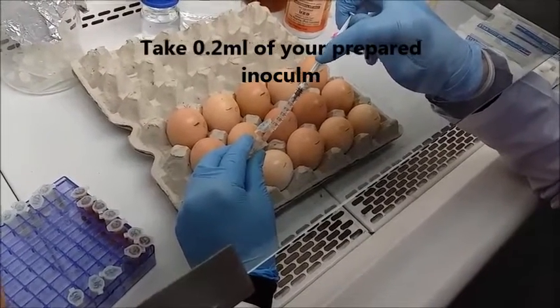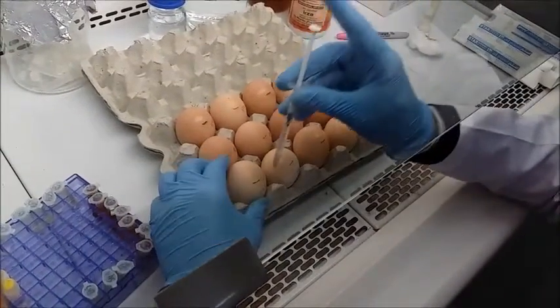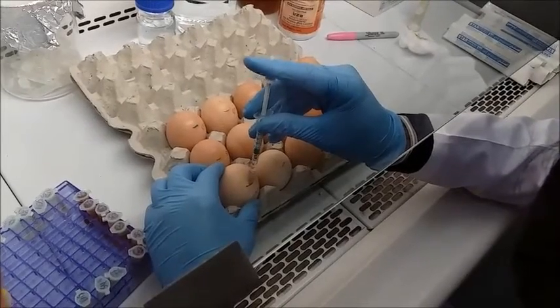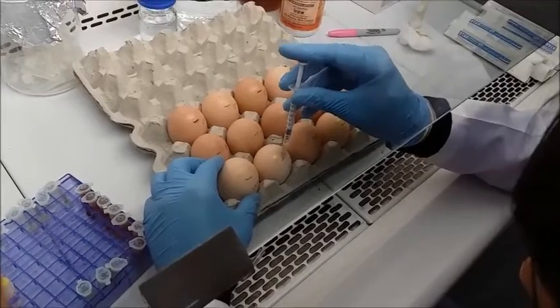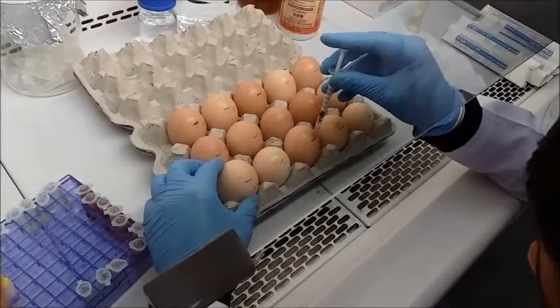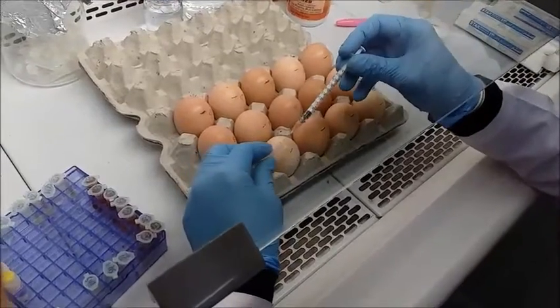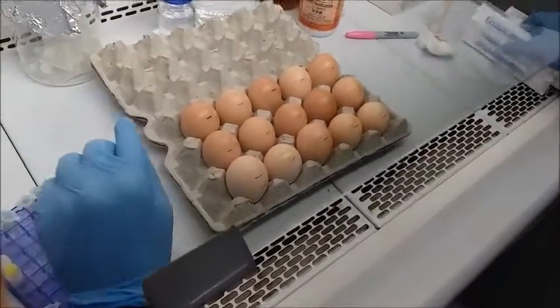Suck up the sample and now inject it through the hole that you made through the pin. Now, as we are actually going forward with the same sample, we are not changing the syringe, but when working with different samples, you need to be sure that the syringes are different.